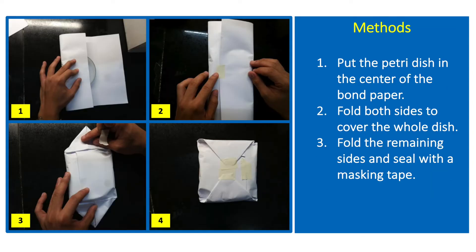Reusable glass petriplates are wrapped in bond papers to prevent contamination prior to the pouring of the culture or media. Just lay a sheet of paper on the table, place the petri dish at the center, fold the longer sides of the paper until the two folds overlap, fold downward the remaining sides of the paper, then seal with the masking tape.